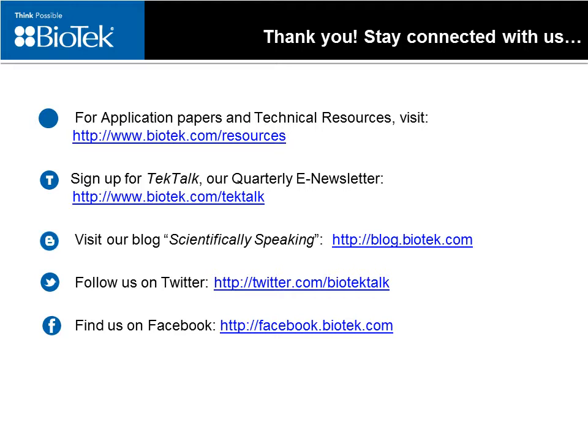A question here about using this technique on different plates. For these assays, we used 96 well clear, flat clear bottom tissue culture treated plates with black sides. There are other plates that can be used, although I'd recommend you visit our website and some of our application notes to get a more detailed answer on exactly which plate types work well for this assay. But it is quite versatile, and it doesn't require specific plates.